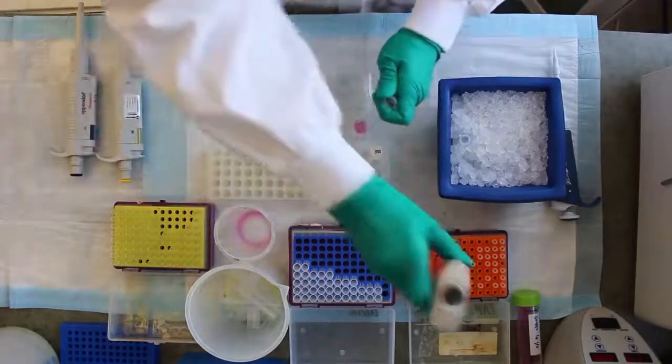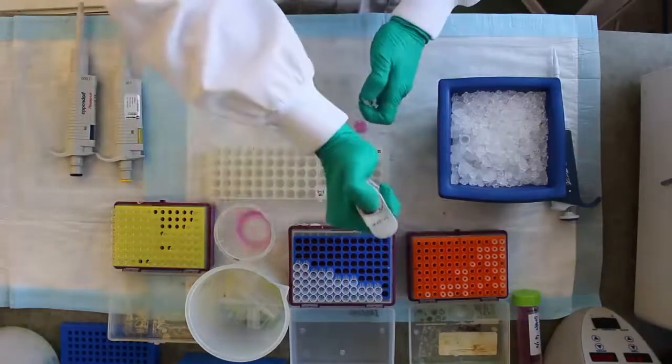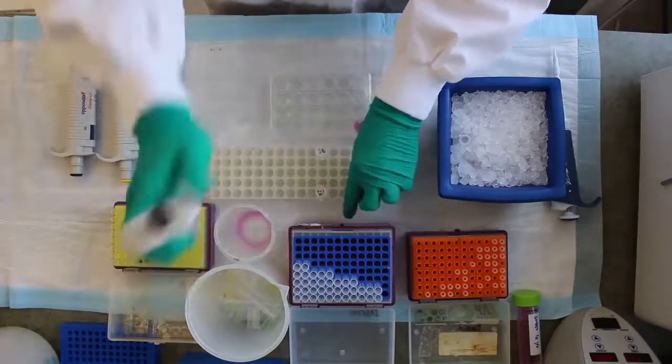The procedure is shown for a 24-well format. First, prepare the lysis buffer, adding benzonase and protein inhibitor cocktail freshly before use.